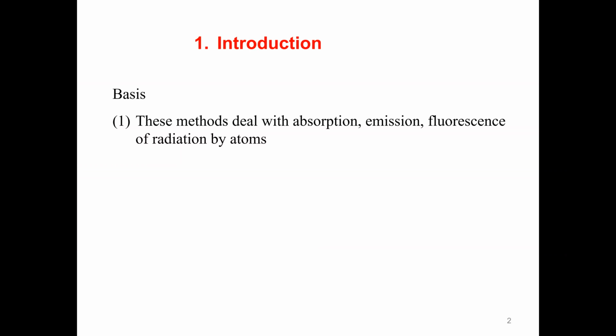First, atomic spectroscopy deals with absorption, emission, and fluorescence of radiation. If we talk about atomic absorption, we use atomic absorption spectroscopy, and we use AAS to represent that.